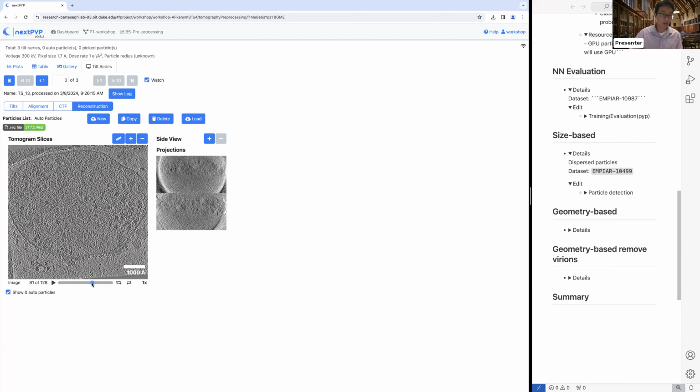So let's find a central section to measure it again. We can try and measure this one, I guess. Was this okay? 132, maybe 140, something like that. This one, 150, 160, okay. Yeah, this way, we have some feeling about how big the ribosome is that we want.